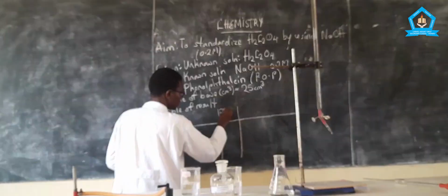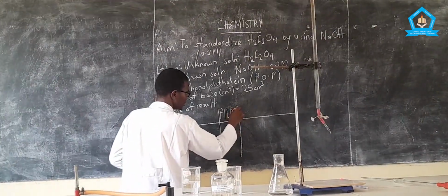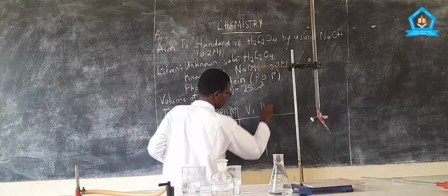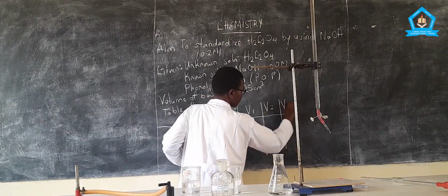We have to start with pilot as our first experiment, followed by V1, V2, V3.